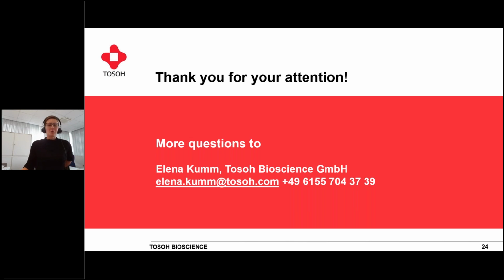I tried to explain it before, but it's hard to say. I know that often, depending on where you're working and what you're doing, you don't want to buy a lot of different columns, but it's really hard to say beforehand whether the stronger or the weaker exchanger would work better. So the best thing is really to test both and then see what looks better.